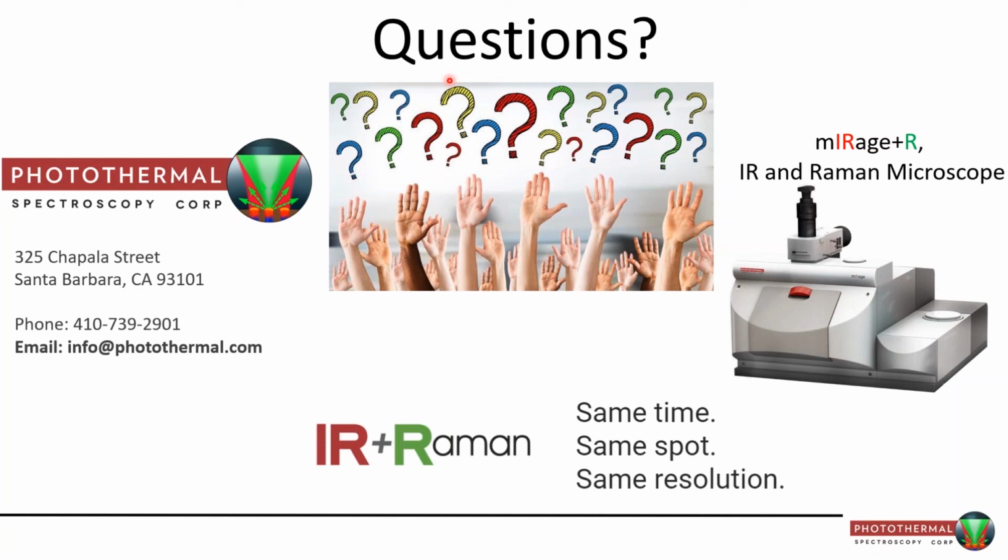Okay, this one is definitely for you. Have there been any aerosols you have not gotten signal from yet? Well, that's one of the nice things about atmospheric particles. This tiny 100 nanometer particle, or 200 or 300 nanometer, it typically is going to have hundreds, even thousands sometimes, of different species in one particle. So there's almost always something that's going to give us signal. So no, we have not yet had a case where we haven't had signal.